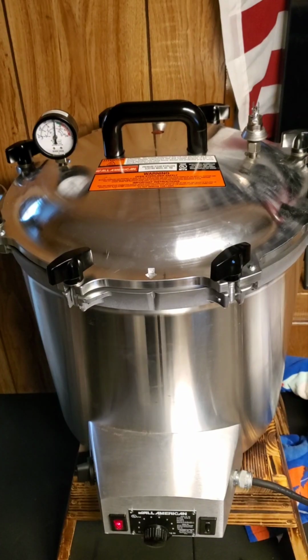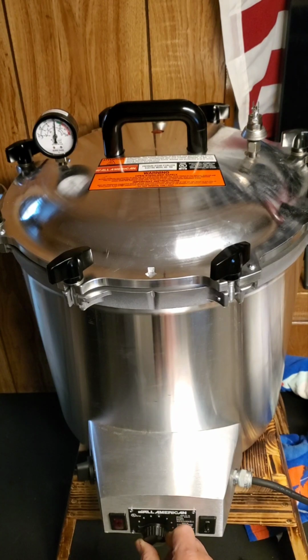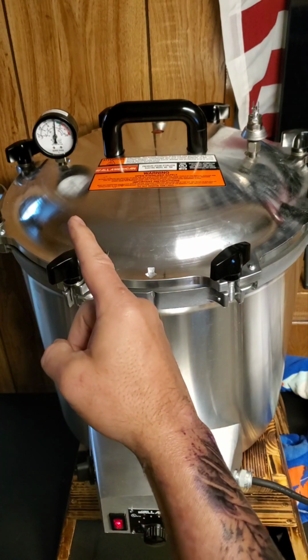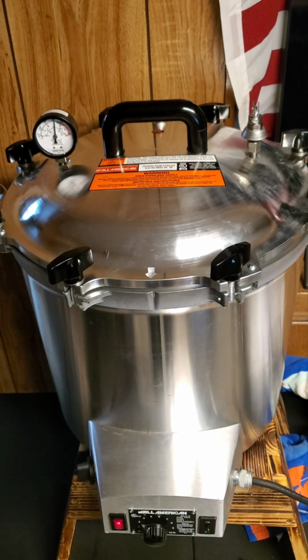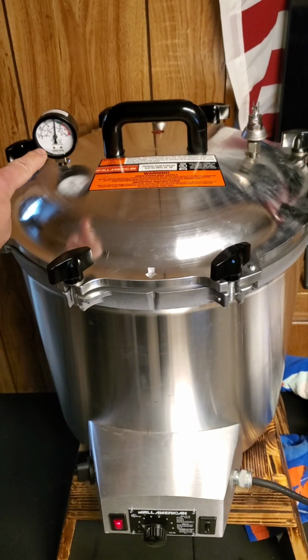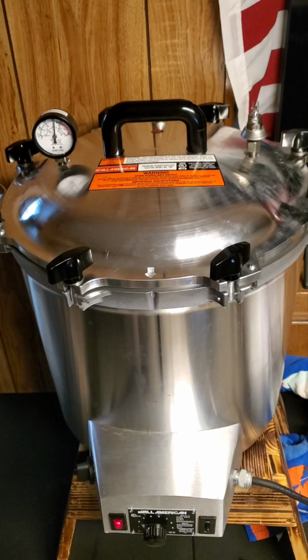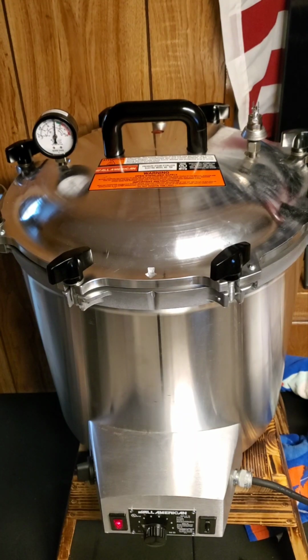All right, we're just over 15 pounds. I'm gonna crank this back way down, turn it off, turn it back to 3.5, which it should pop on, exactly what we want, right at 3.5. And now we'll set our timer. I'm gonna let you watch. It should pop up to just into the green, around 17, 18, turn off and go back down. So we're gonna let this roll for a minute while I'm over here on the computer.